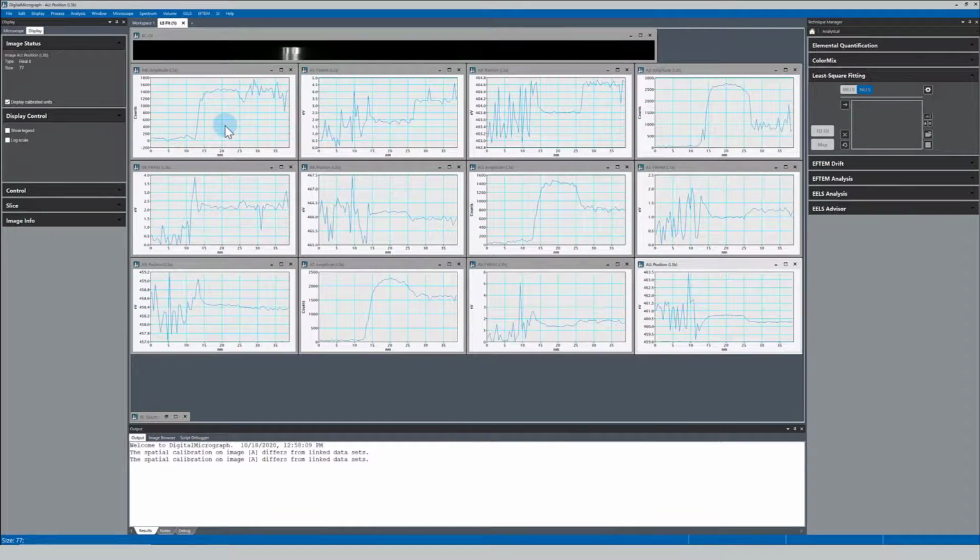So you can see why it's important that we named our data earlier, because we've got loads and loads of line plot displays, and it would probably be hard to figure out which one is which unless we actually named them.